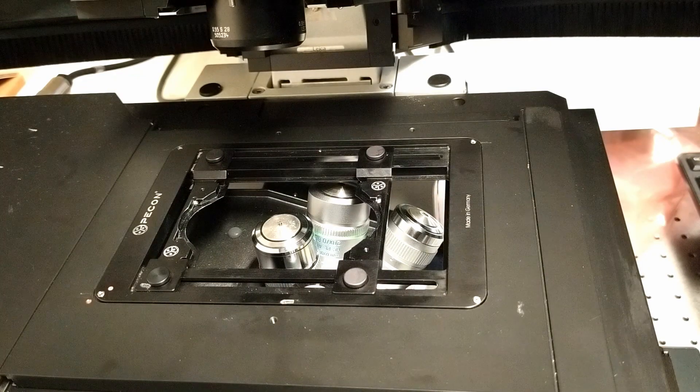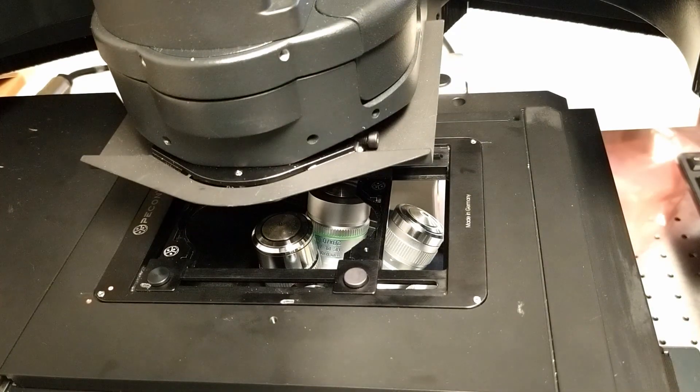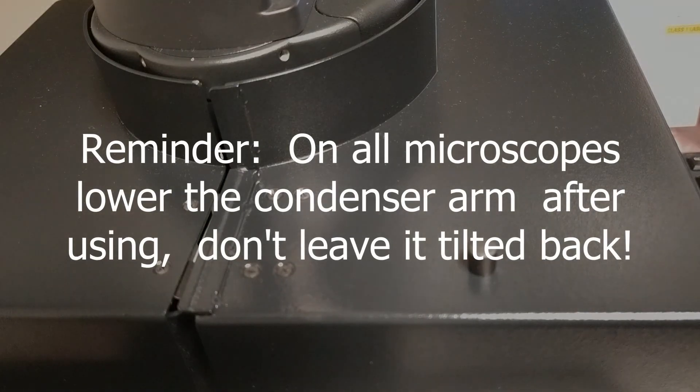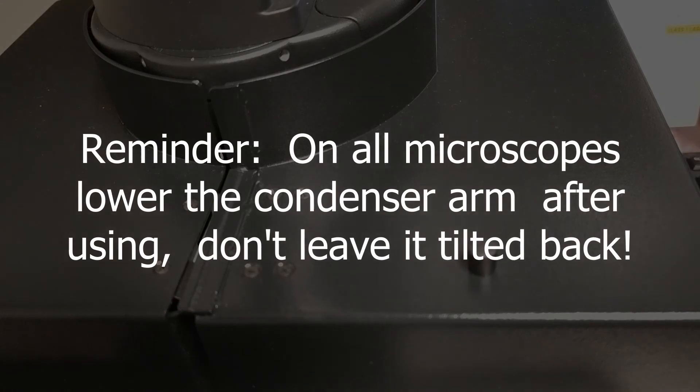Then lower the condenser arm and close the laser safety box. Remember to do this on all microscopes — lower the condenser arm after using. Never leave it tilted back.